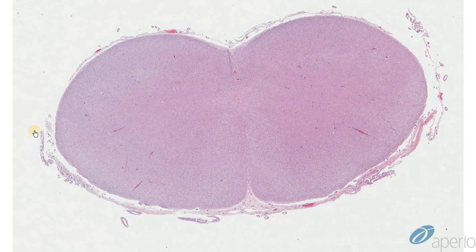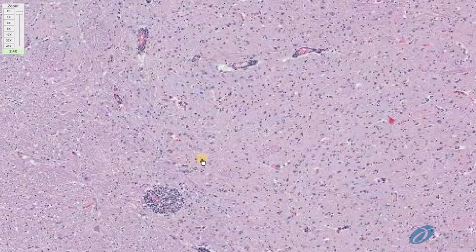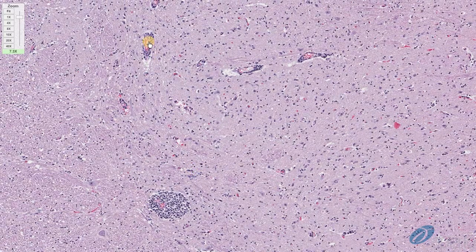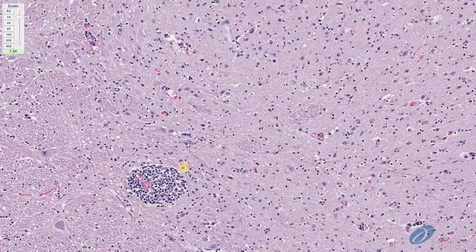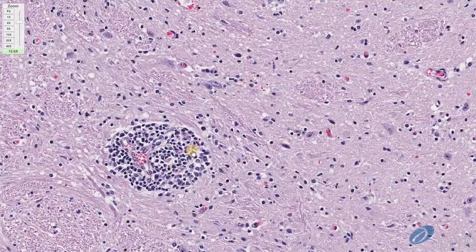This is a case from a cow, and this is a cross-section of the medulla oblongata. Under low magnification, we can already appreciate some areas showing basophilia, which indicates there are cellular aggregates in these regions. At high magnification, we can see that the clear spaces around blood vessels — referred to as Virchow-Robin spaces — contain several layers of mononuclear cells composed of lymphocytes, plasma cells, and macrophages. This is called a perivascular cuff.